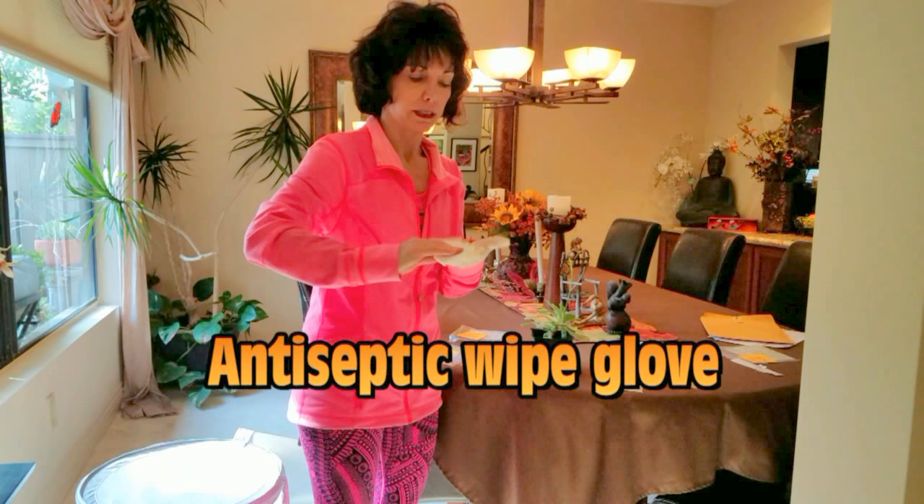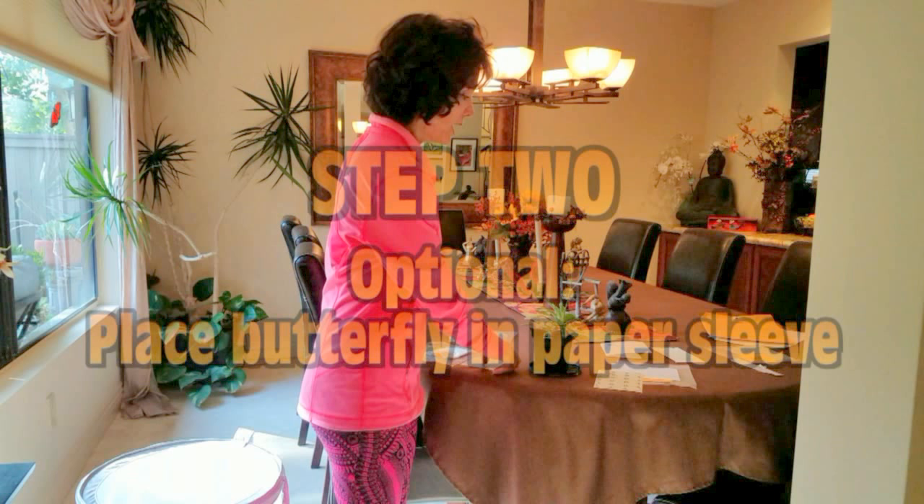I'm going to test her for OE. Step one: I put on my glove, and I take an antiseptic wipe, and I wipe my glove to get rid of anything else that might contaminate her.